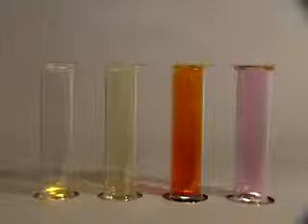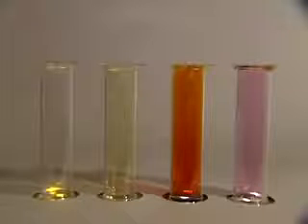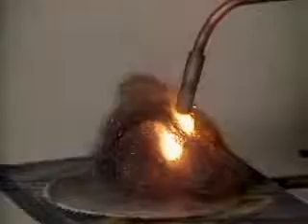Whether solid, liquid or gas, the halogen elements consist of diatomic molecules F2, Cl2, Br2 and I2. Fluorine often reacts ferociously with almost everything else. A stream of fluorine instantly sets iron wool on fire, and it does the same thing to charcoal.